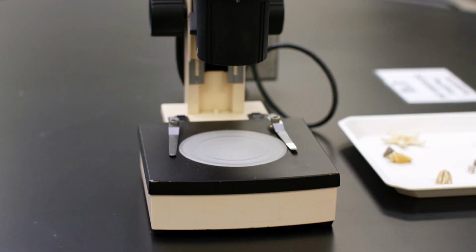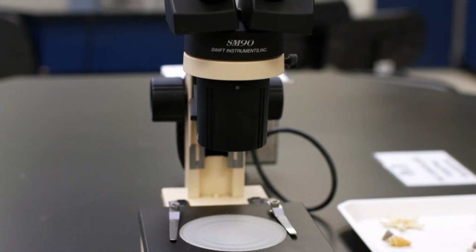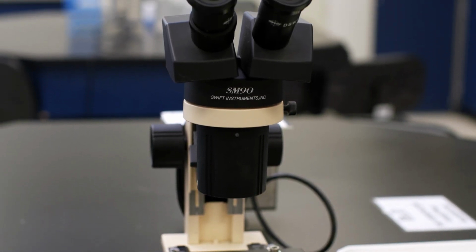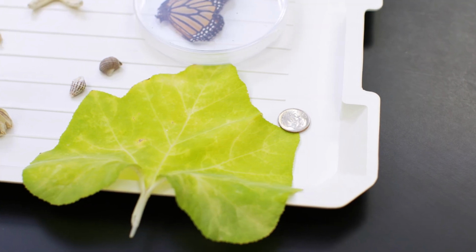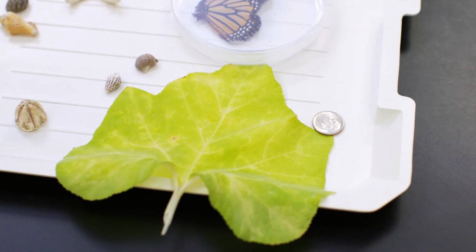Right, so what we're going to be looking at now is called the stereoscopic dissecting scope. What you would use a dissecting scope for is looking at things that are bigger. We call that the gross level, not like, ooh, gross, just big. All right, so these are some items that you might look at underneath the scope.